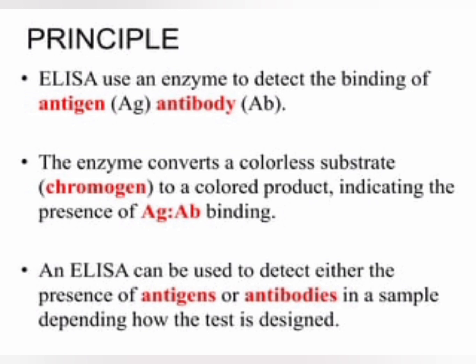The different ELISA techniques can be employed for both qualitative as well as the quantitative estimation using standard curves prepared from the known concentration of antibodies or the antigens. Indirect ELISA can be used for the estimation of antibodies, or the determinations can also be done for the antigens by using the method of sandwich ELISA and also the competitive ELISA.